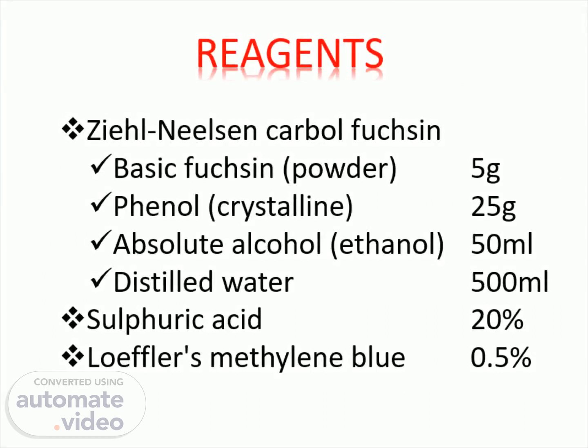Reagents we need. Ziehl-Neelsen carbol fuchsin: basic fuchsin powder, 5 grams; phenol crystalline, 25 grams; absolute alcohol, ethanol, 50 milliliters; distilled water, 500 milliliters. Sulfuric acid 20%, percentage may differ depending on the organism. Loeffler's methylene blue 0.5%.